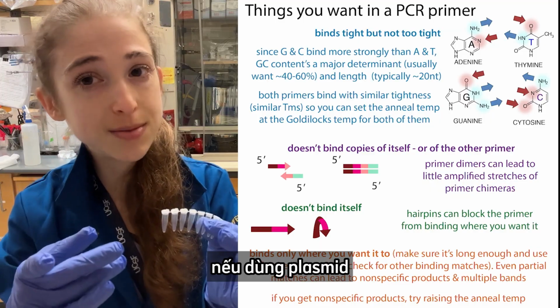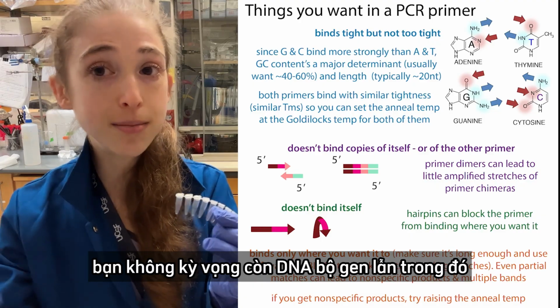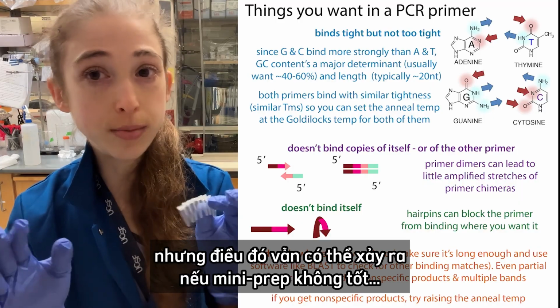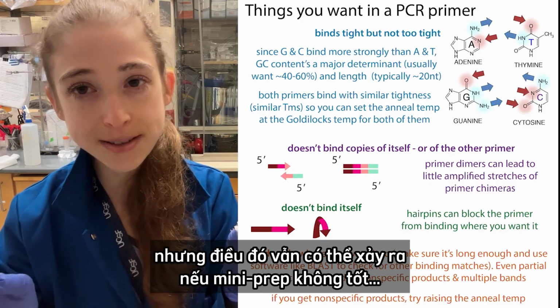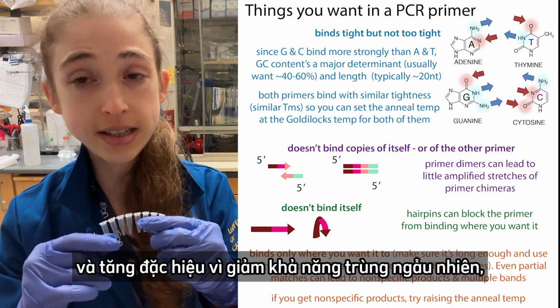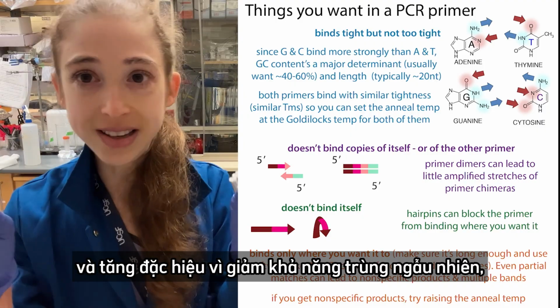If you're using a plasmid, you might not expect there to be E. coli genomic DNA in there matching your primers, but that can also happen if you don't do your miniprep well. So increasing the length increases the TM, and also increases the specificity by making it harder for a match to just randomly occur.